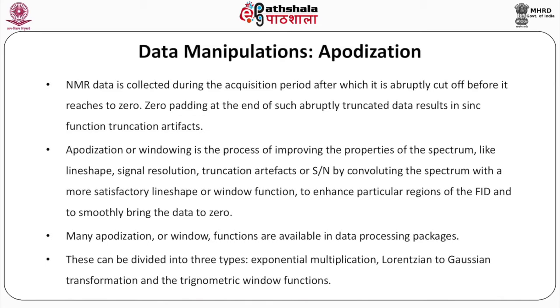Apodization or windowing is the process of improving the properties of the spectrum like line shape, signal resolution, truncation artifacts or signal to noise ratio by convoluting the spectrum with a more satisfactory line shape or window function to enhance particular regions of the FID and to smoothly bring the data to 0. Many apodization or window functions are available in data processing packages.